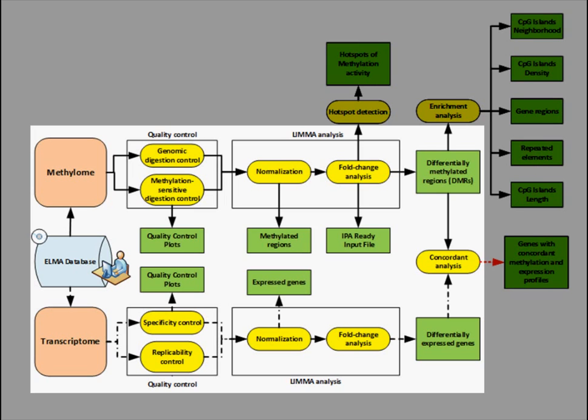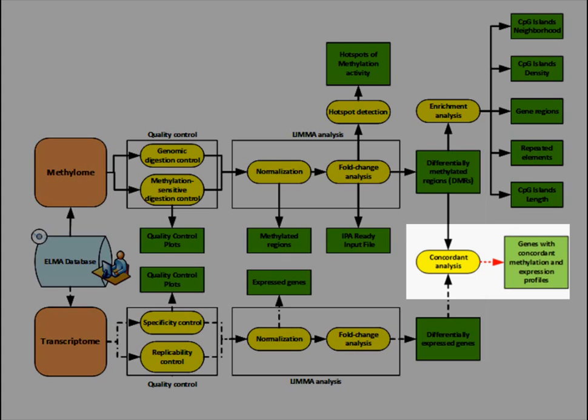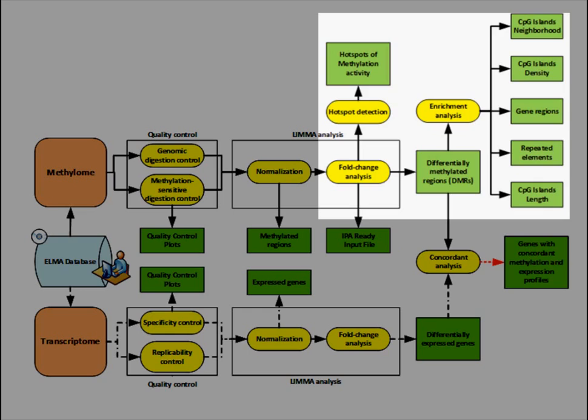One of the main draws of the EmbryoGENE platforms is their comprehensive, fully automated analysis pipeline, which we call EMAP, for EmbryoGENE's Microarray Analysis Pipeline. The results of both a transcriptomic and an epigenetic experiment can be analyzed in parallel, and EMAP will generate lists of expressed genes, methylated regions, differentially expressed genes, and differentially methylated regions for both experiments. EMAP can then integrate both of those lists into a combined analysis which seeks coordinated transcriptomic and epigenetic changes.